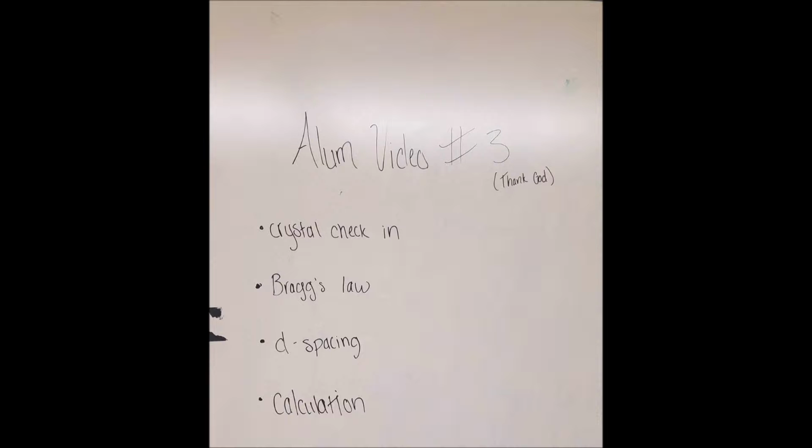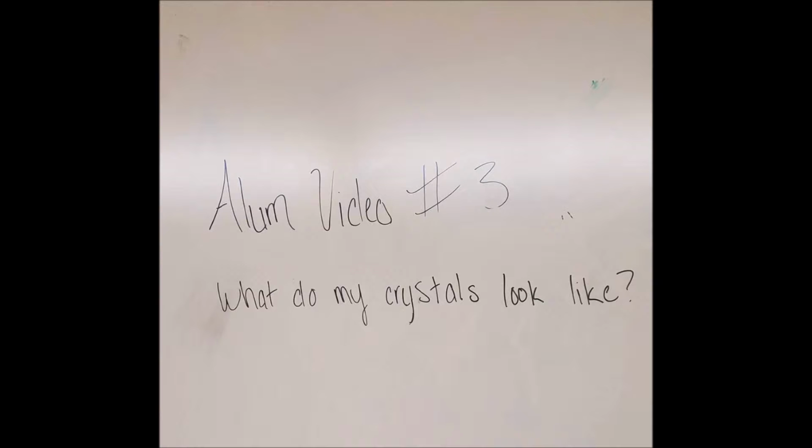Today we'll be talking about what my crystals look like now, Bragg's Law, how to grow bigger crystals, what is D-spacing, and a final calculation for the D-spacing of our alum crystals. So, what do my crystals look like?